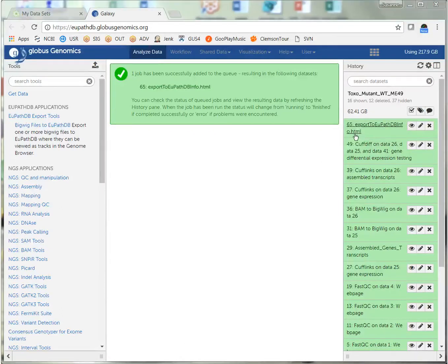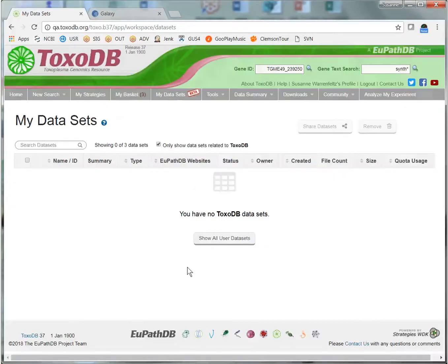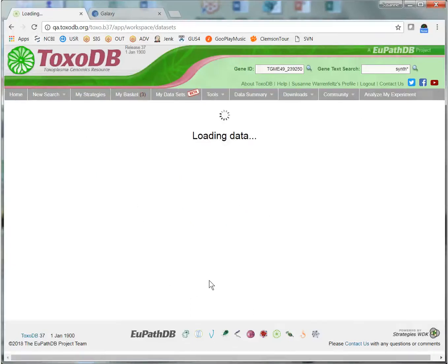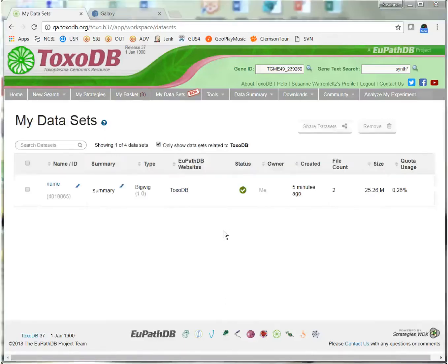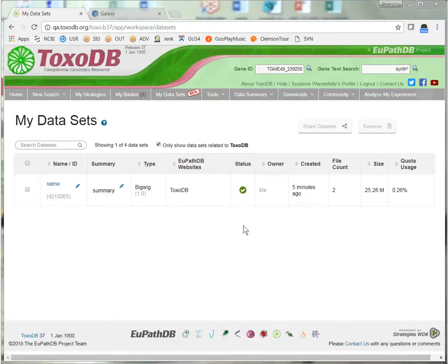Now that we have a green history tile for the export, we can go back to ToxoDB, reload the My Datasets page, and our dataset should be there. The My Datasets table now contains my dataset that I just transferred. The status is green, so we know the files arrived at ToxoDB, and there are two files in this dataset.